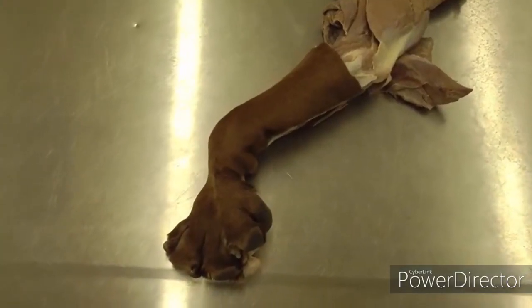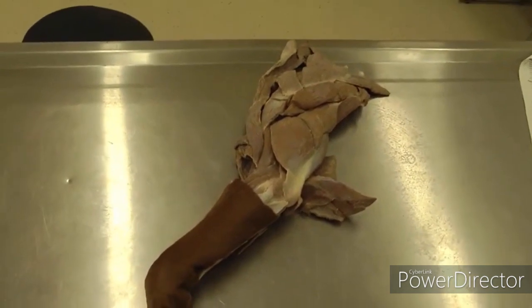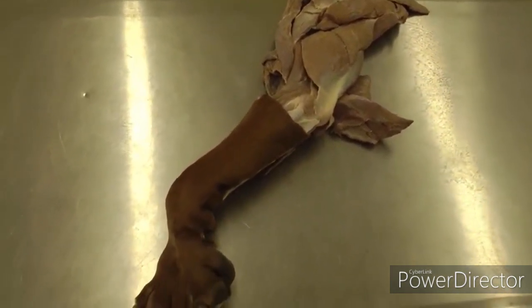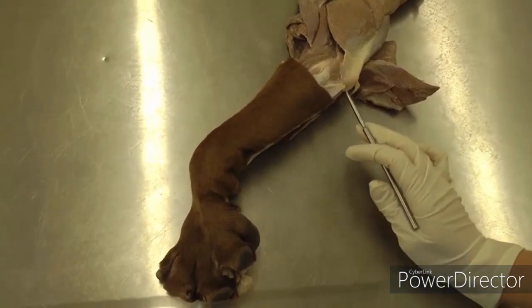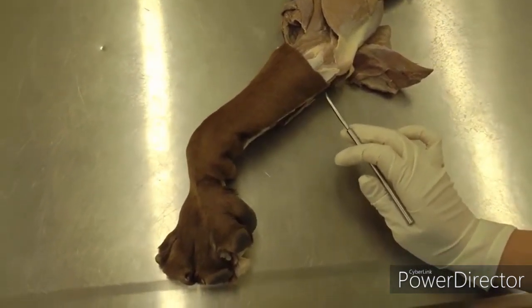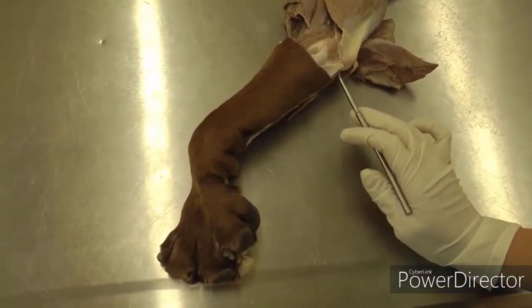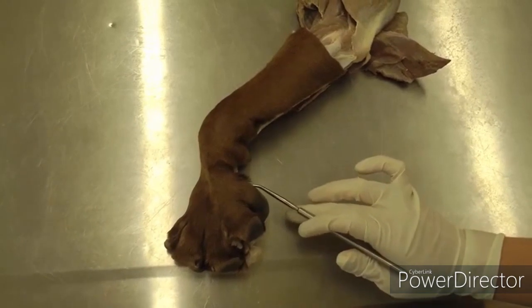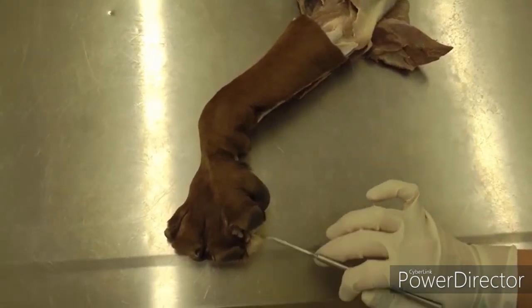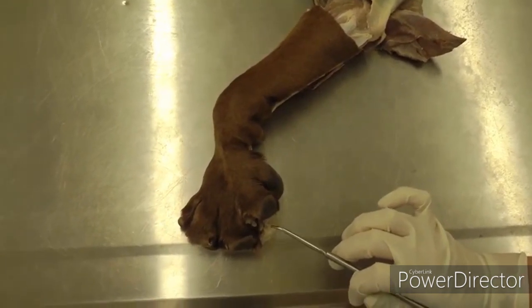This is Lab 4 in the dog. We're finishing up the forelimb — the isolated forelimb — and you'll need to skin the rest of your foot. Start at the elbow, make an incision on the caudal lateral side, all the way down through the carpal metacarpal pad and down to the toes. You need to skin out at least one or two toes.